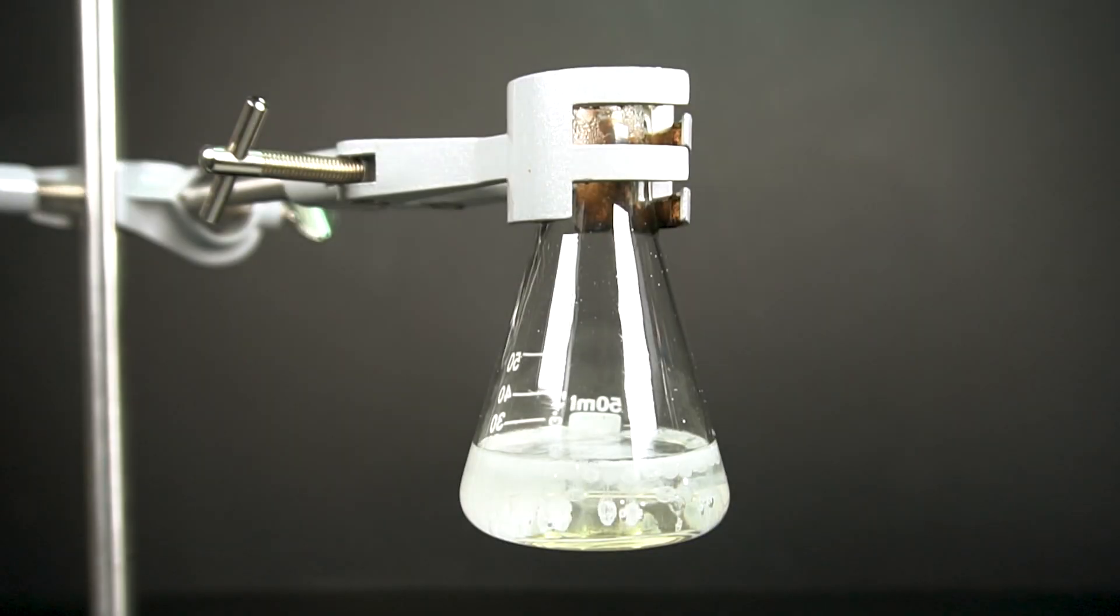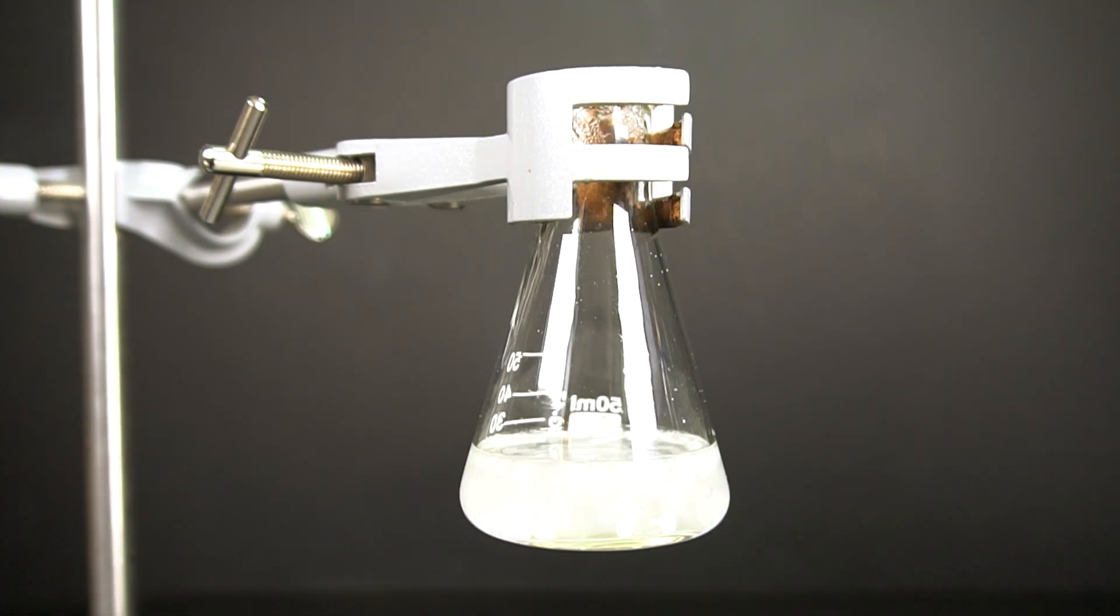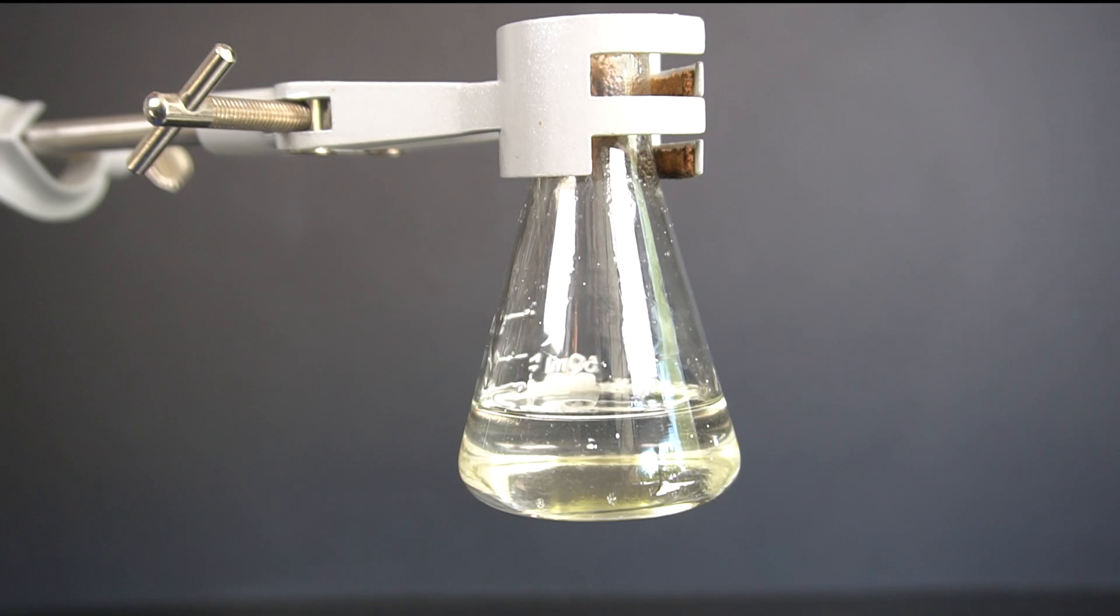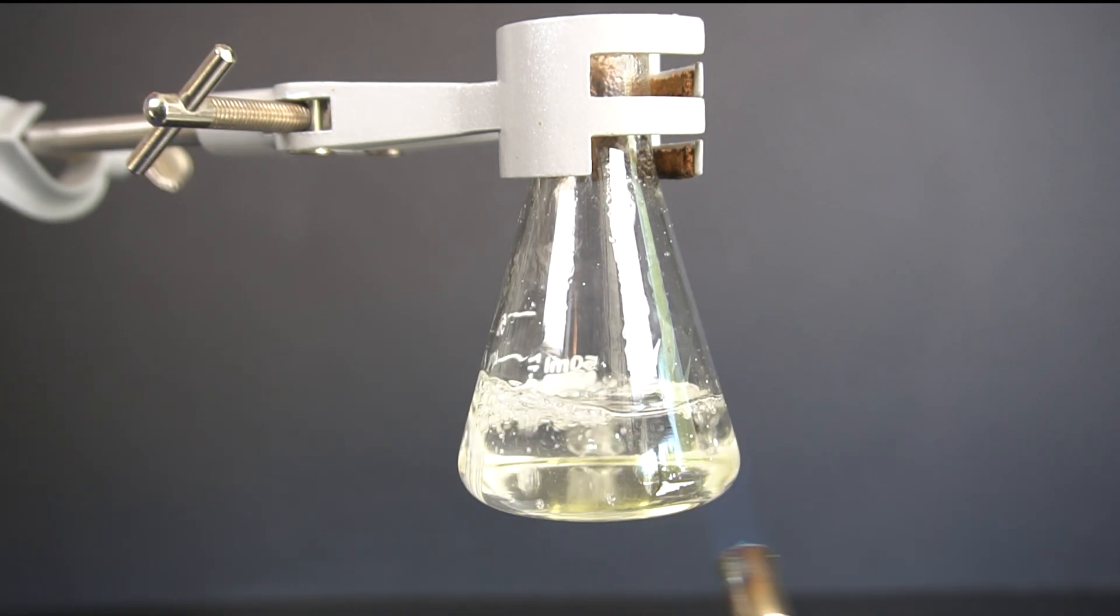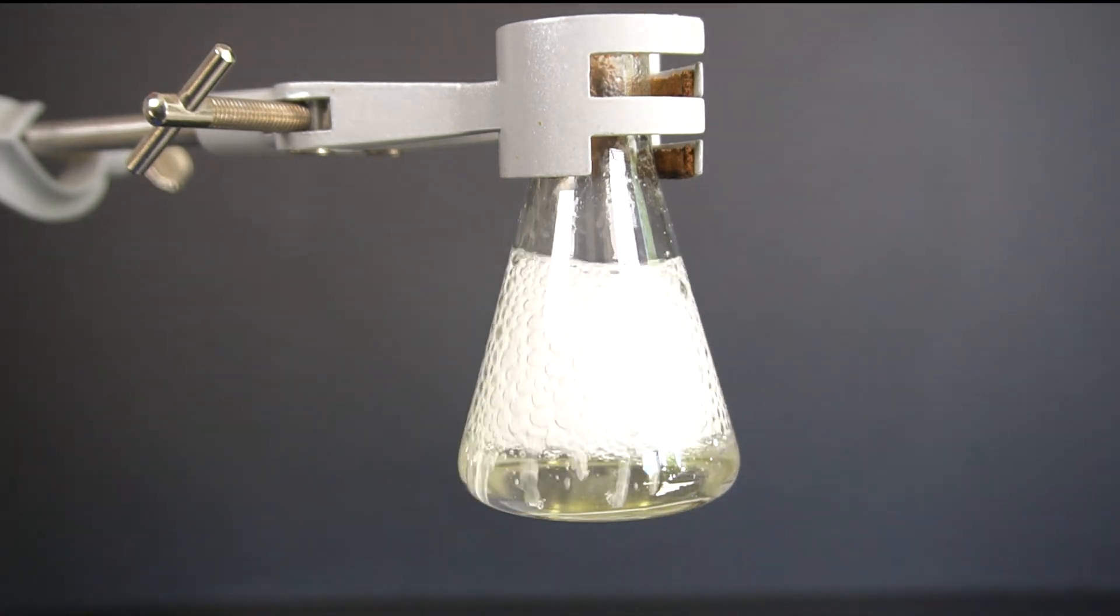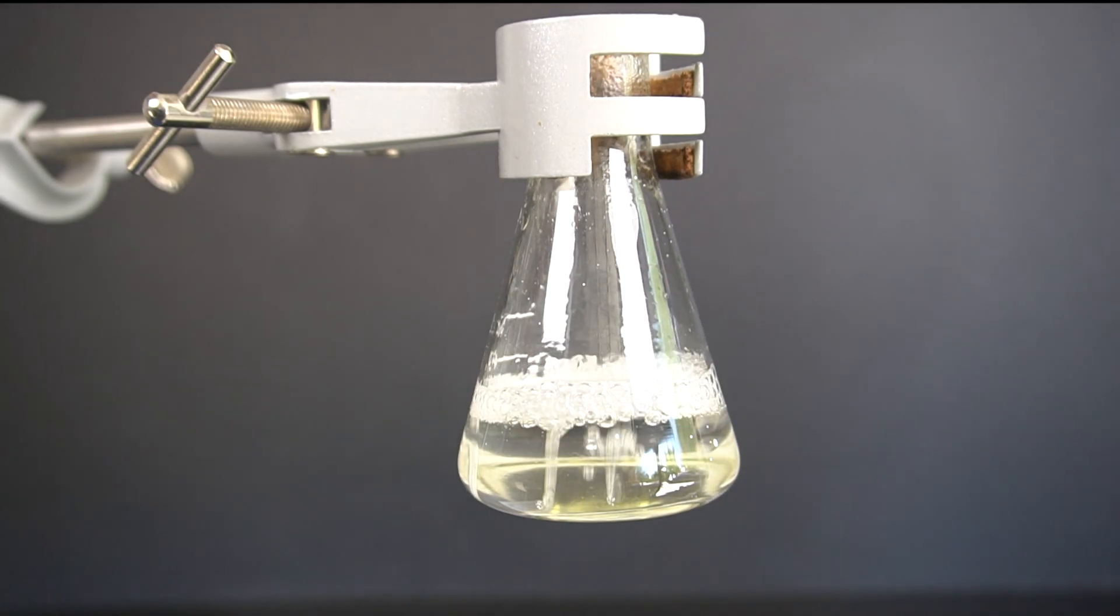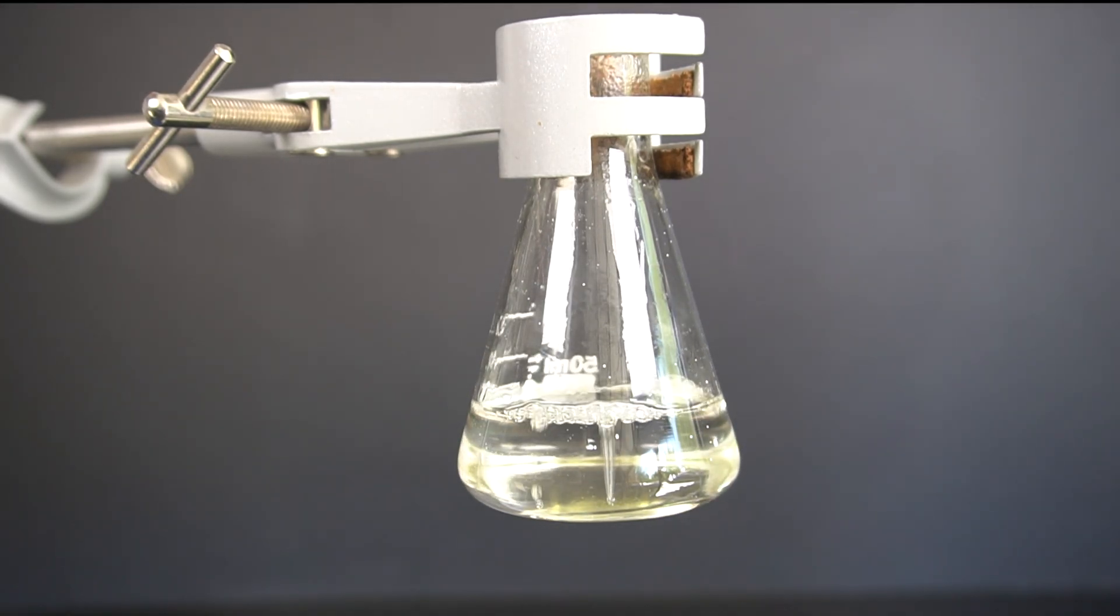Once all of the silica has been reacted into the sodium hydroxide, the solution will turn from cloudy to crystal clear. This part of the process took just under 2 hours to add all of my 12 grams of silica. Once the final addition of silica had been added, we wait for everything to clear up, followed by letting the solution cool at room temperature. From here, we have a solution of sodium silicate.